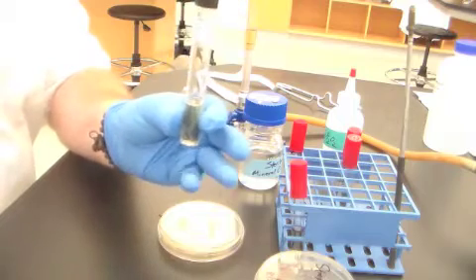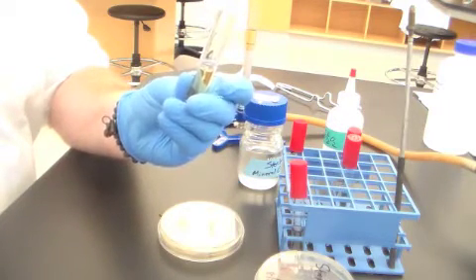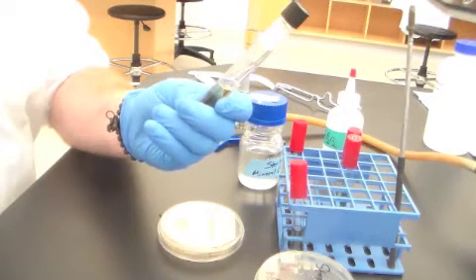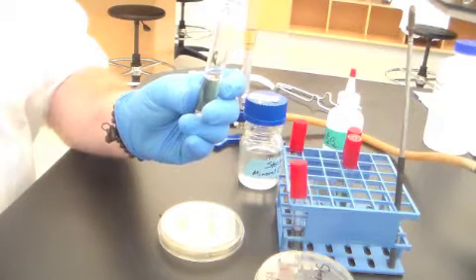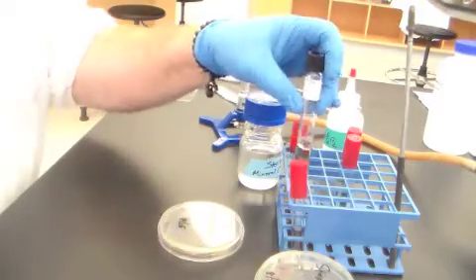Oxygen doesn't diffuse through that mineral oil. So once the bacterium uses up the oxygen in the bottom portion of this, that's a very nice anaerobic environment. And if this bacterium is capable of decarboxylating the amino acid lysine, it can do so because the anaerobic conditions have been set up to do so.